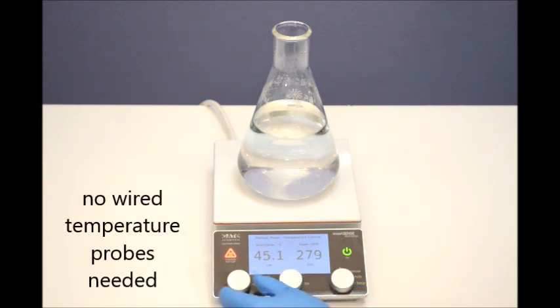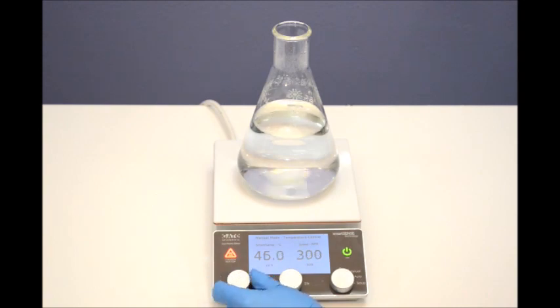The base station will use the information to control the temperature of the hot plate such that the temperature of the liquid will attain the desired set point.